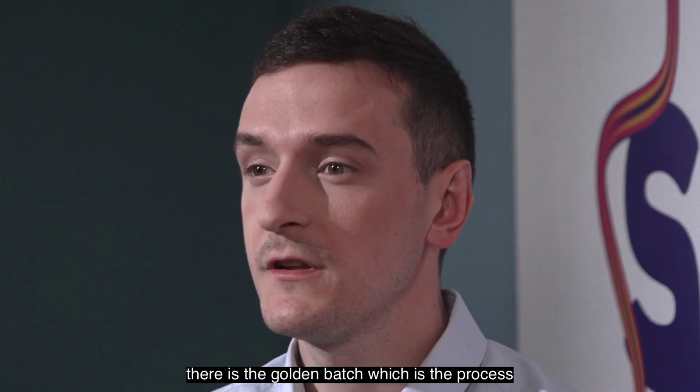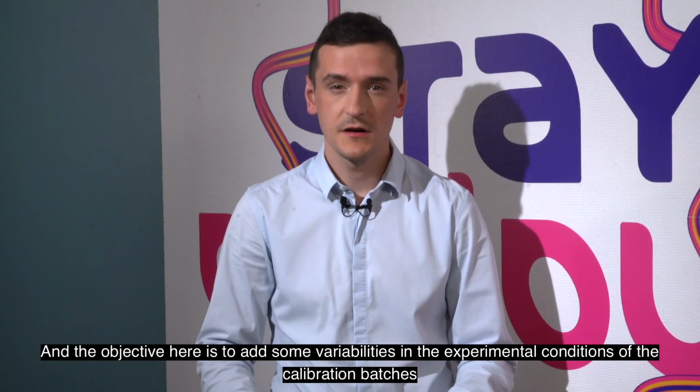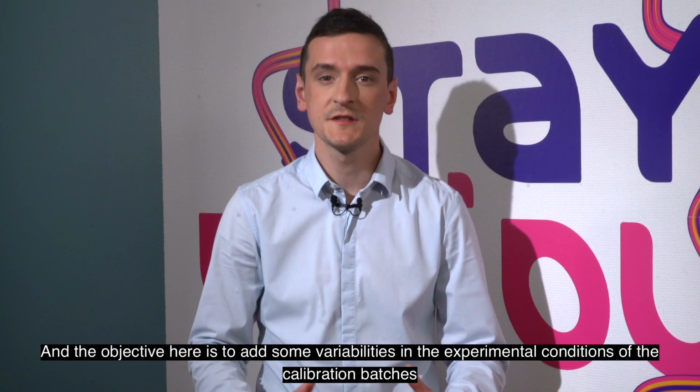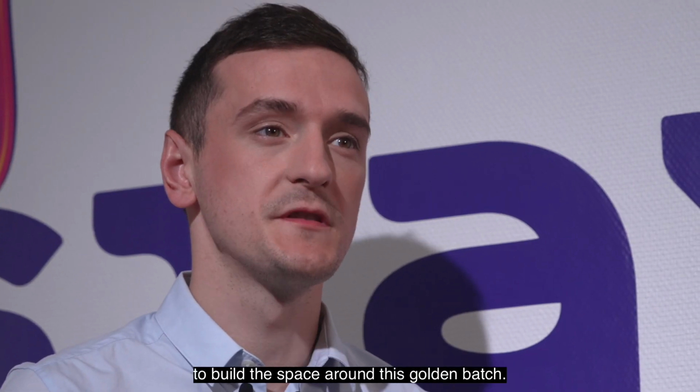the calibration step. Within the model space, there is the golden batch, which is a process that the customers want to reach. And the objective here is to add some variabilities in the experimental condition of the calibration batches in order to build the space around this golden batch.